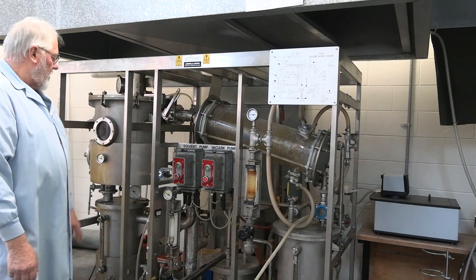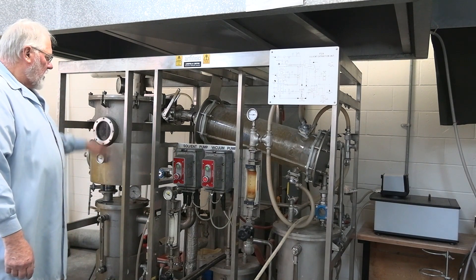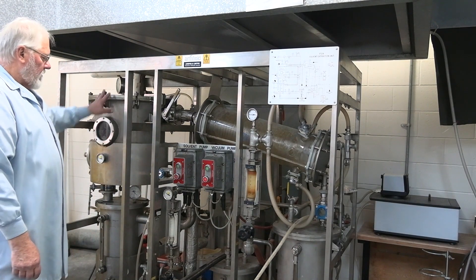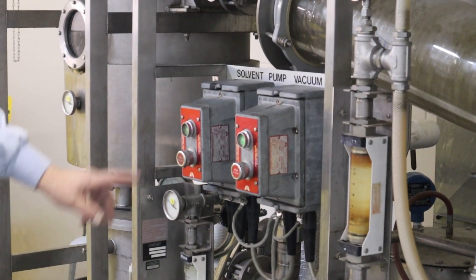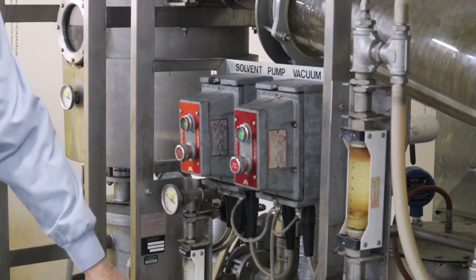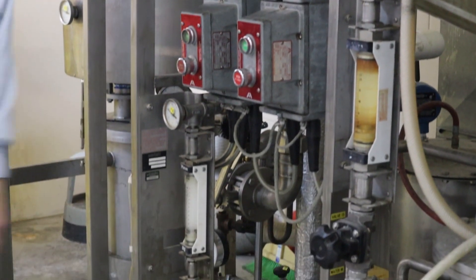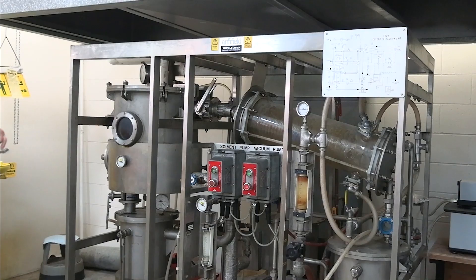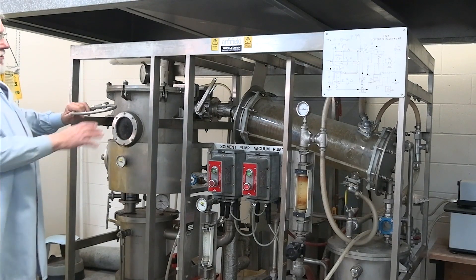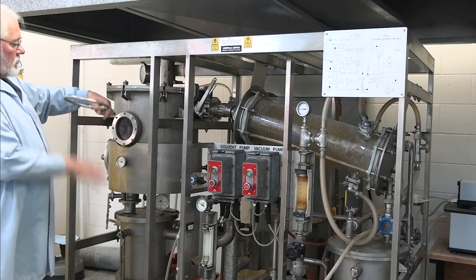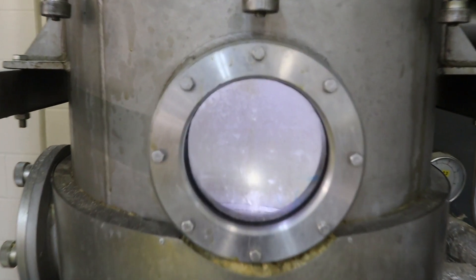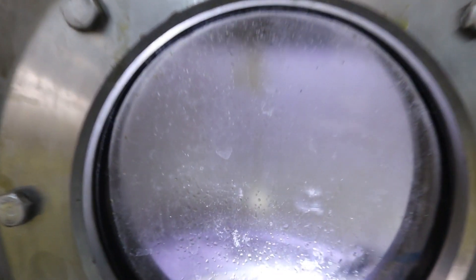The next step in the process would be once your flakes are inside of here and it's closed up, we will turn on the pump and adjust this accordingly about halfway. There's a spray ring that goes in the top of this extractor. Solvent is sprayed through nozzles down over the flakes inside of here.